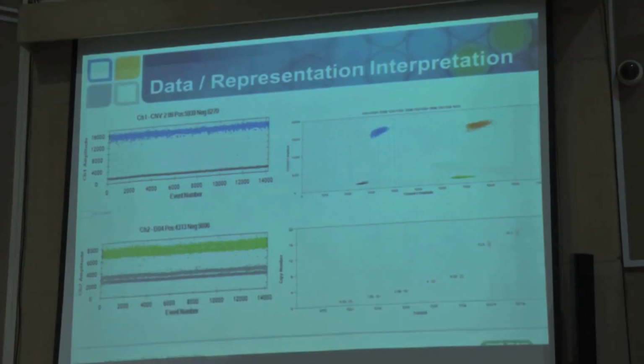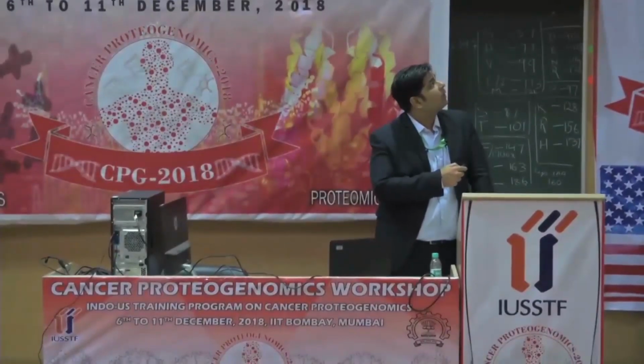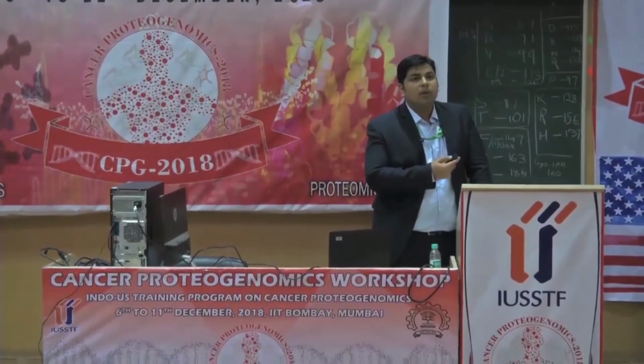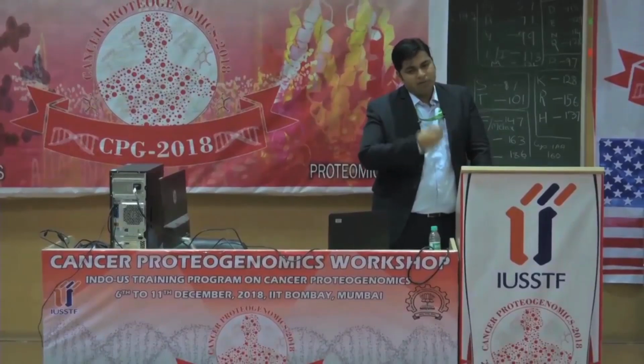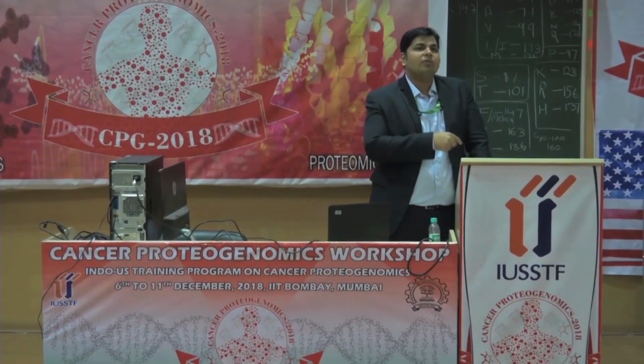In case you know one of your standards, even if you have one standard, for the first time you put a new reaction, you have one sample where you know this is going to work for sure. You just put that once and see which fluorescence amplitude it comes to, and you know that value next time. So, if you are getting something variable, that means there is something non-specific also amplifying along with your specific product.